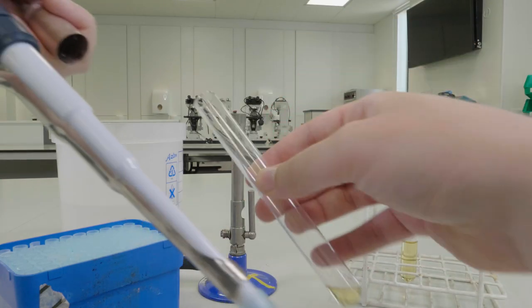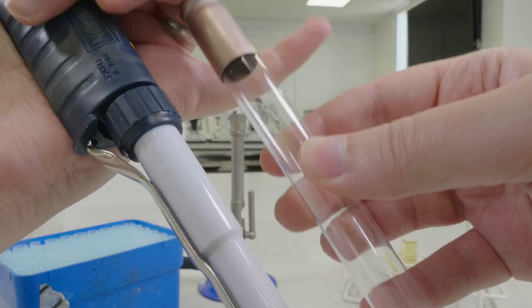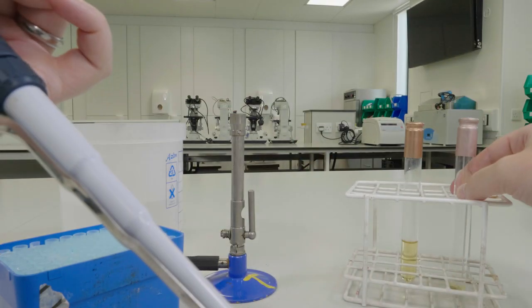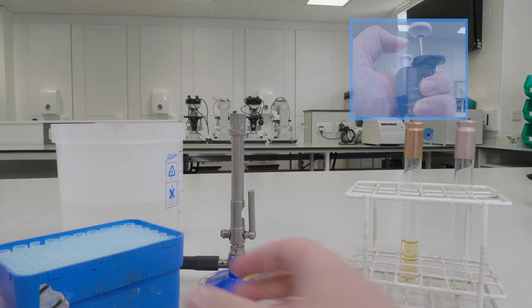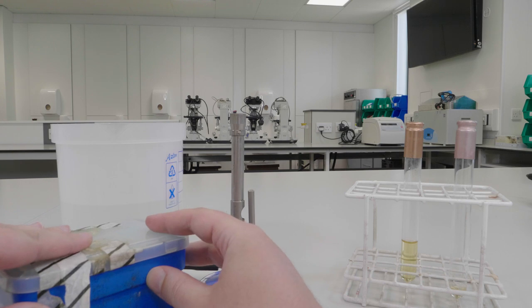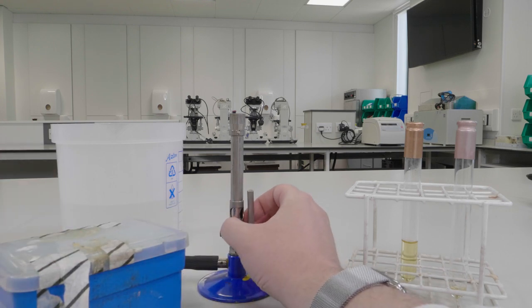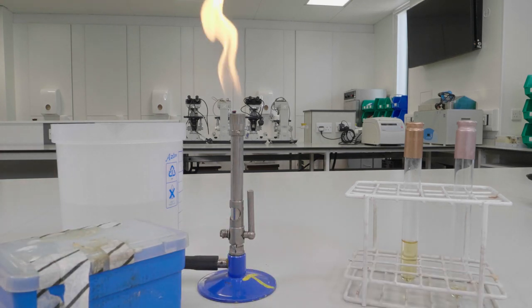Flame the neck of the tube once more, place the lid back on and then place this into the rack. Eject the tip into the dispo jar using the eject button on the top of the pipette and then close the lid of your tip box before turning your flame back onto the yellow safety flame.